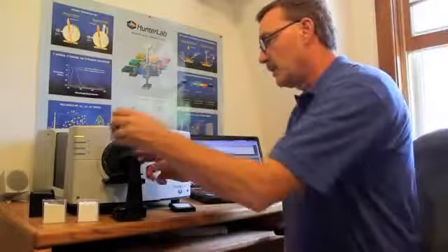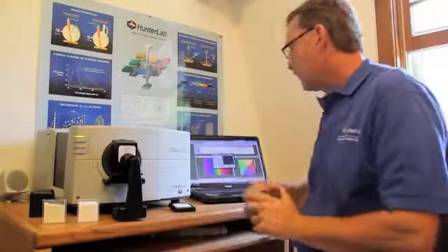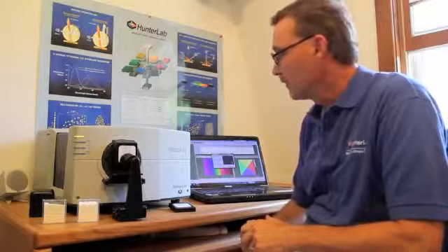Northeastern U.S. Sales Representative Ken Wendt will now demonstrate how to use the Ultrascan VIS, a visible range, high performance benchtop system.